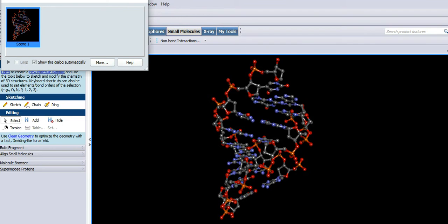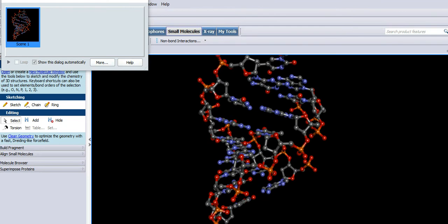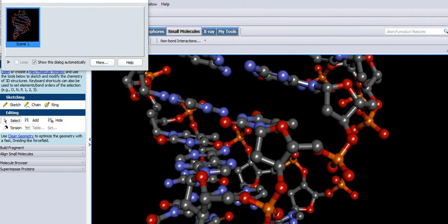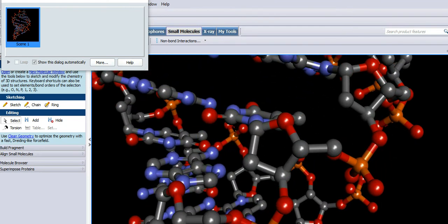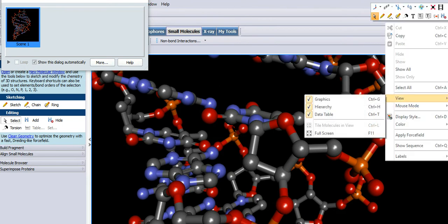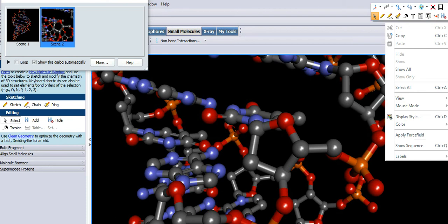So let's zoom in a little bit. Take another shot. Right-click. Top left, another screenshot.